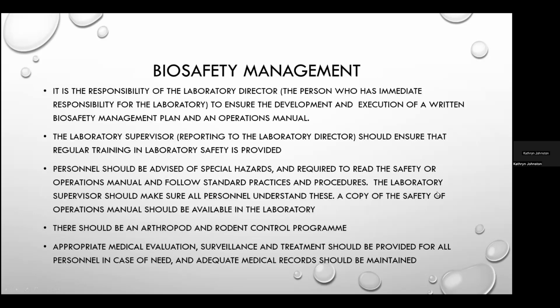Biosafety management. Biosafety management is the same as exposure control. So this speaks to staff being familiar with exposure management policies and procedures, as well as identifying someone with responsibility for overseeing the process. That includes ensuring that the staff are trained and updated regularly on exposure management. This would typically take place as part of an annual review program.